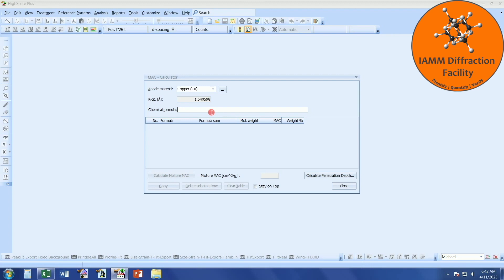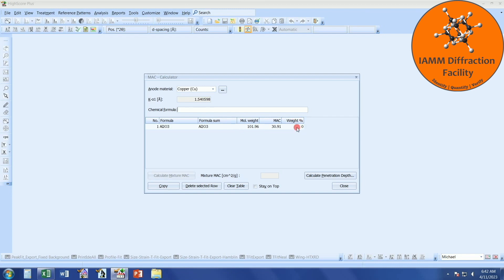Here, you can enter the chemical formula of your sample. For this example, I will assume that we have Al2O3, and then hit Tab on the keyboard. At this point, the software calculates the molecular weight and the mass absorption coefficient.